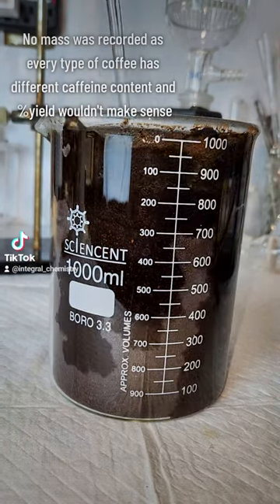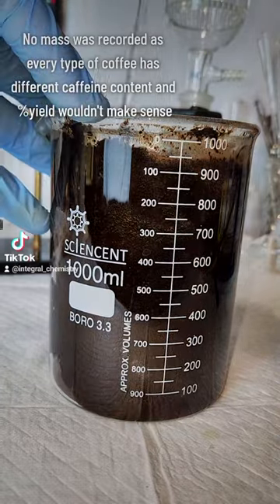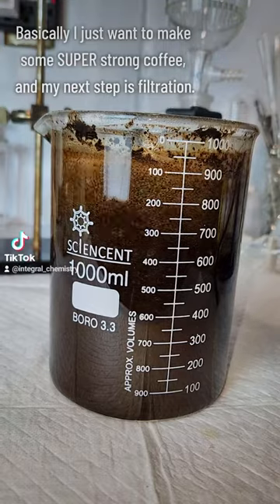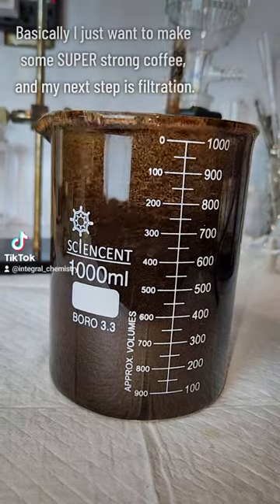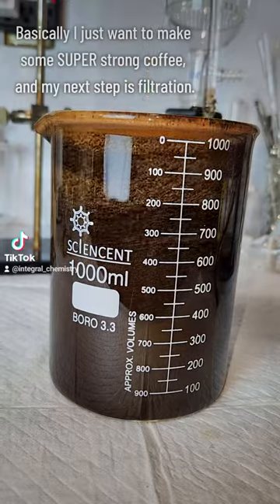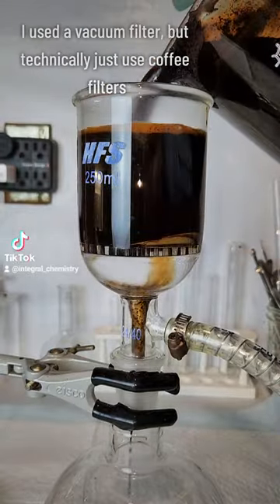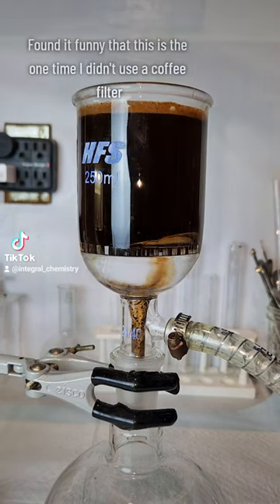I only ended up using the bag on the left, and I didn't record mass as every different type of coffee has a different caffeine content, so calculating percent yield really wouldn't make sense. The next step is to filter this off like if you were making a normal cup of coffee, but I decided to use a vacuum filter to sort of expedite the process considering I have so much volume here.